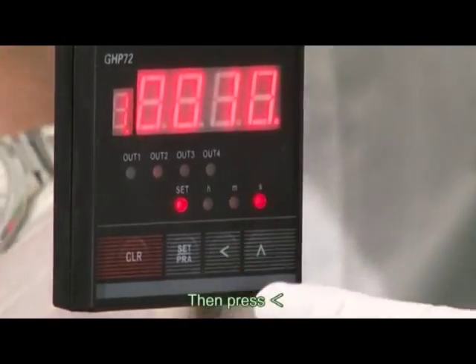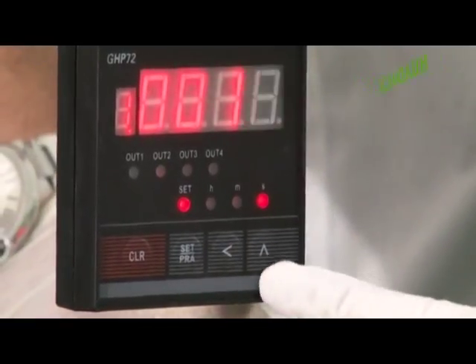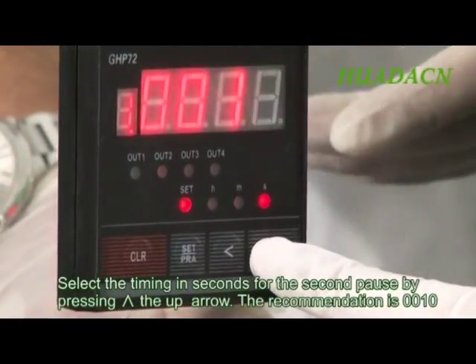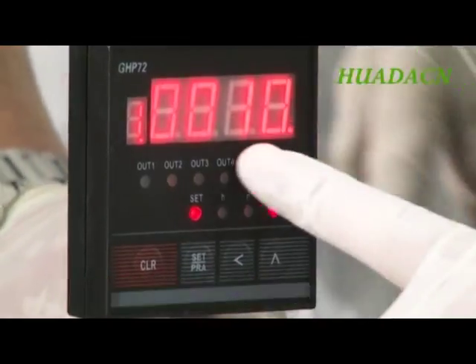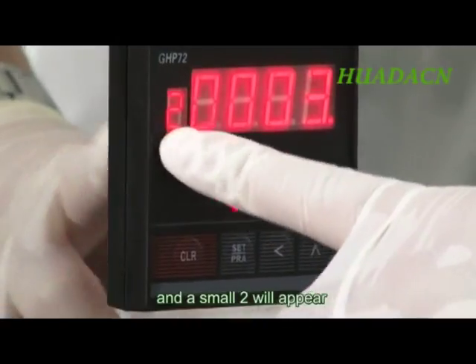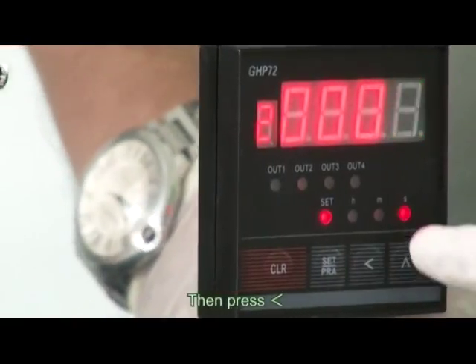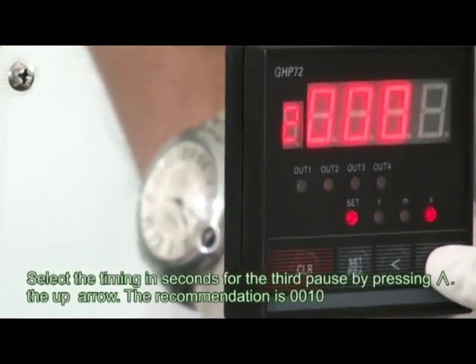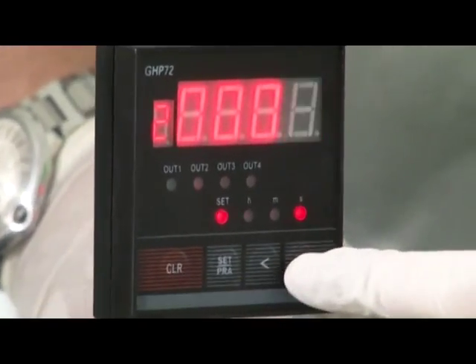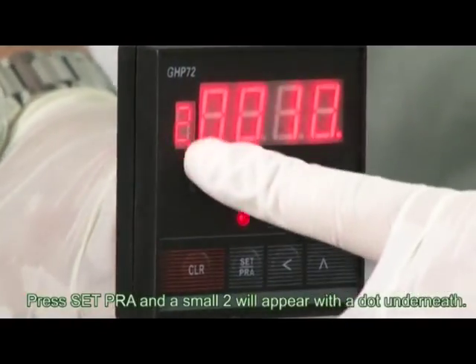Then press the left arrow. Select the timing in seconds for the second pause by pressing the up arrow. Press Set Pra and a small two will appear. Then press the left arrow. Select the timing in seconds for the third pause by pressing the up arrow. Press Set Pra and a small two will appear with a dot underneath.